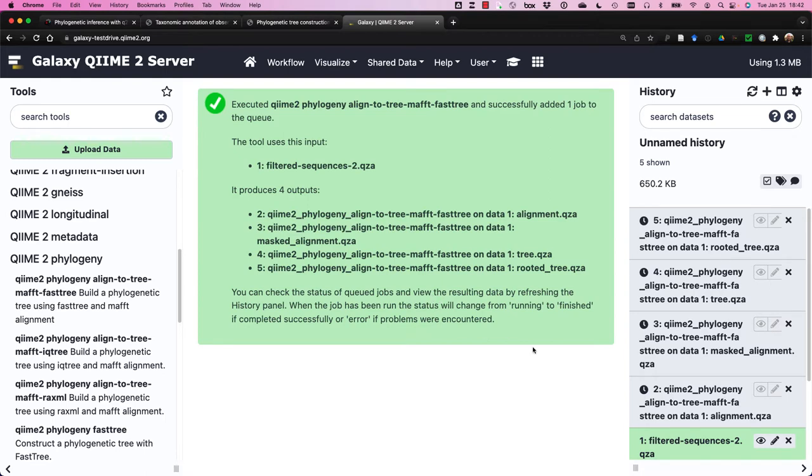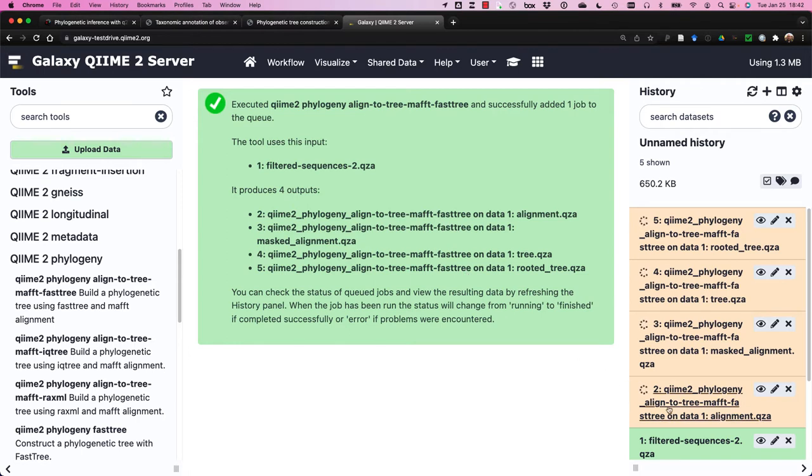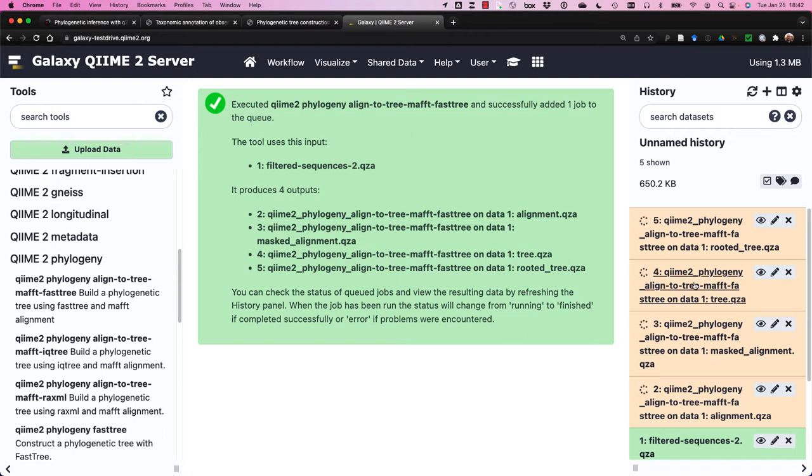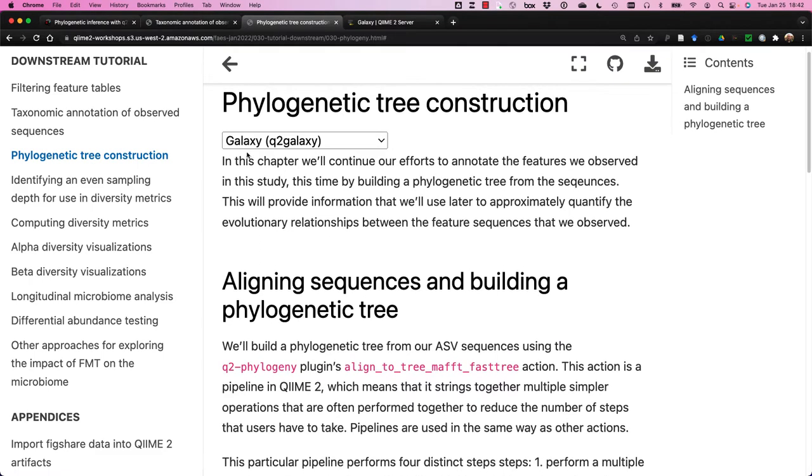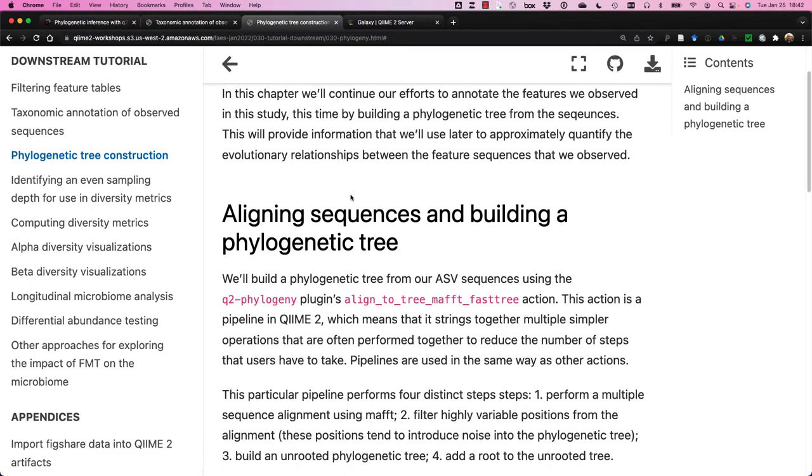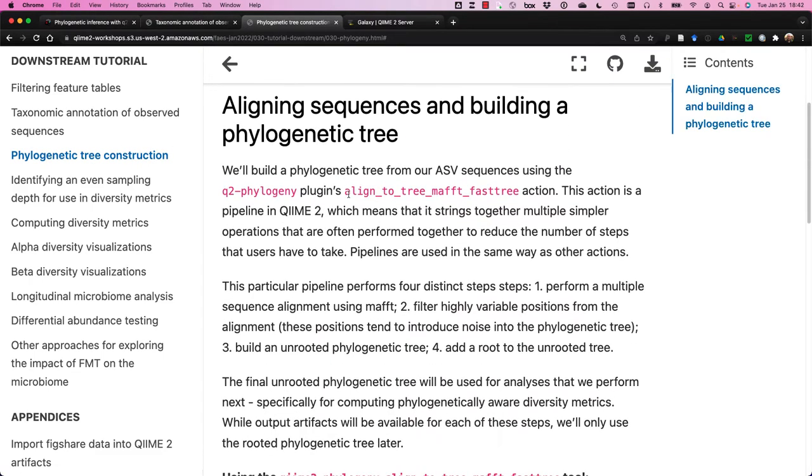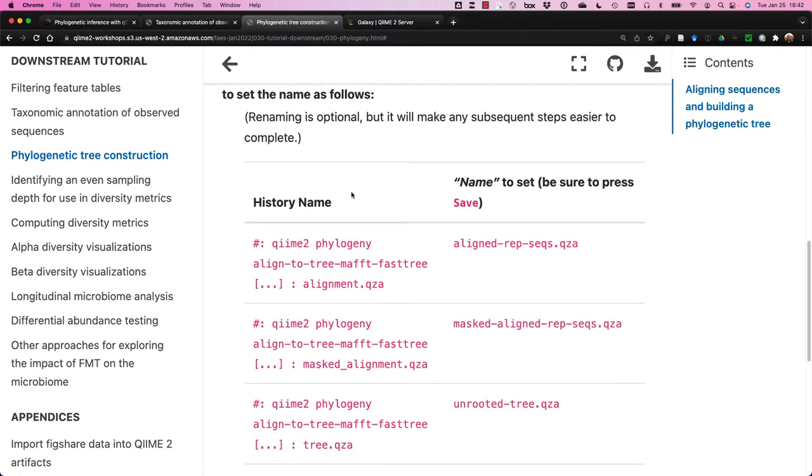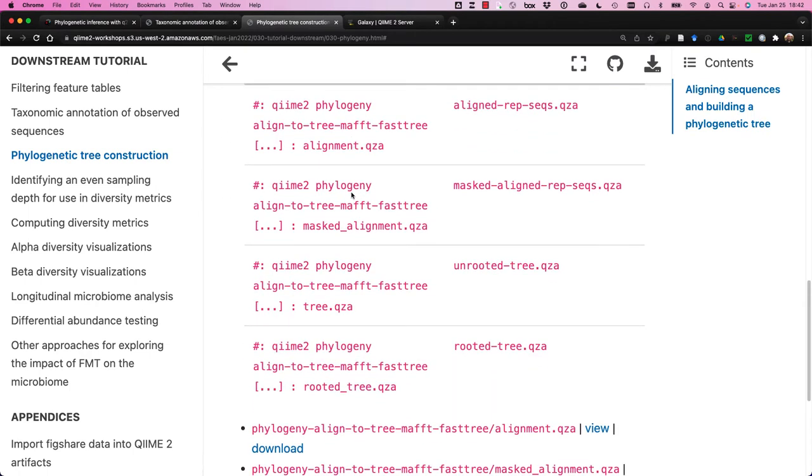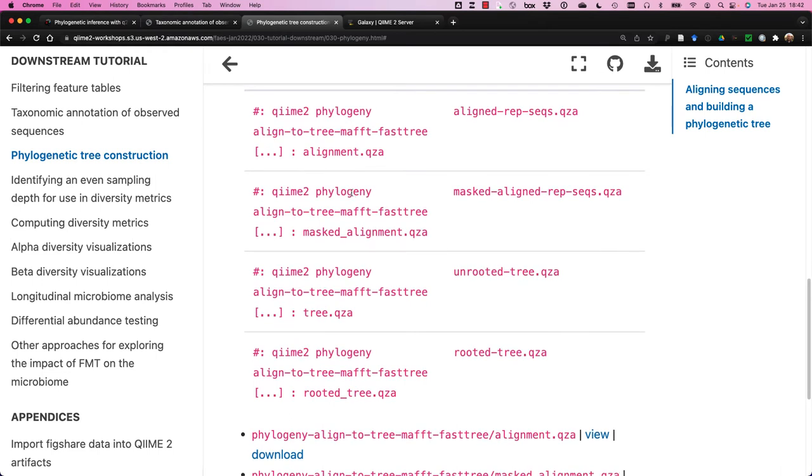Now, as you can see, there are four outputs that will be generated, and they're all being run in order here. We will receive an alignment, we will obtain a masked alignment, a tree, and then finally, our rooted tree. Now, while that's running, I'm going to go over to the actual tutorial we're running, which is here, Phylogenetic Tree Reconstruction. And we're going to make sure our file names are consistent with what's in this tutorial, so that we can use these files for all of the other downstream processing we'll be performing within Galaxy.